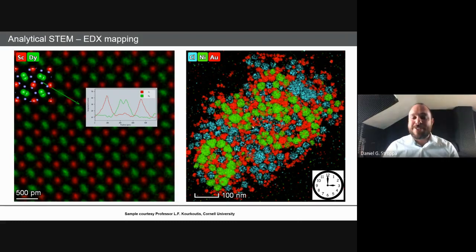Yeah, so the next part is about how to play smart and get informative samples. And actually, the question on magnetism is an interesting one because it's somewhat related. So the idea is that the fundamentals on how we image and how we work with the microscope are there. I think that you got some idea on that. But then the challenge is how you get to the most difficult samples or the most practical problems that you want to answer. So here, first you need to fit the sample to the TEM.